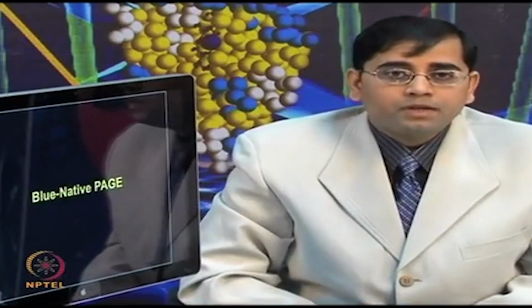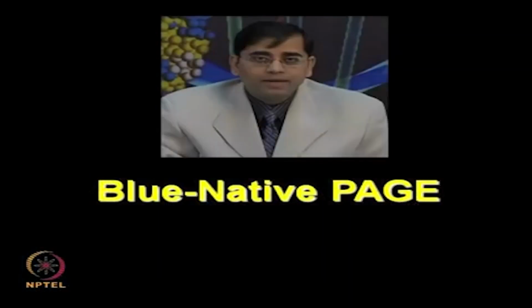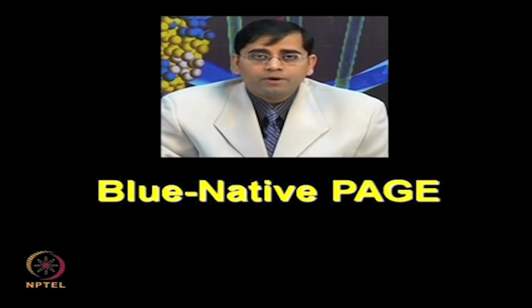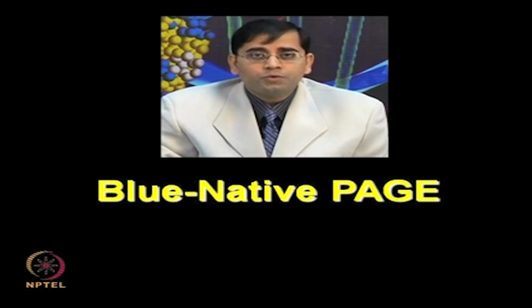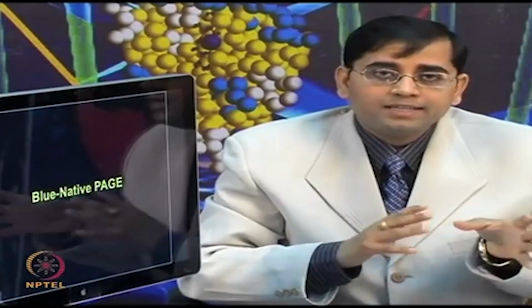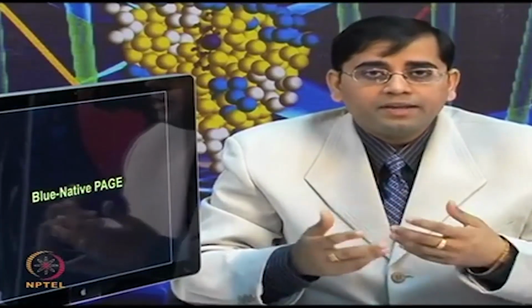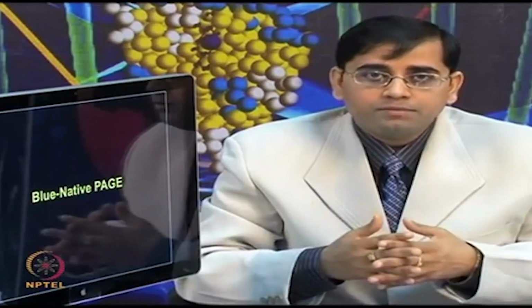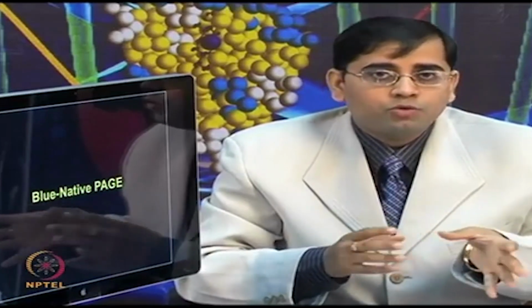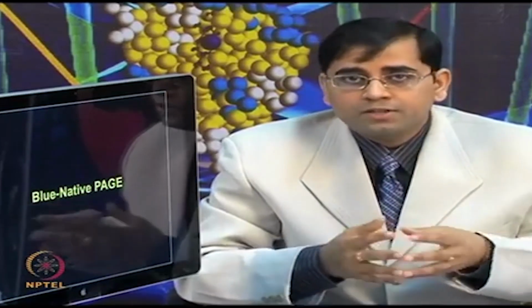So, let us now move to a variation of SDS PAGE known as blue native PAGE, blue native polyacrylamide gel electrophoresis. Now, in SDS PAGE we are providing a denaturing environment, we want to denature the protein, whereas in the blue native PAGE we want to separate the proteins in their native condition. And by applying these two techniques together, by using SDS PAGE and blue native PAGE, one can obtain very unique and different information, often related to the isoforms, subunit composition, molecular weight and different types of post translational modification.